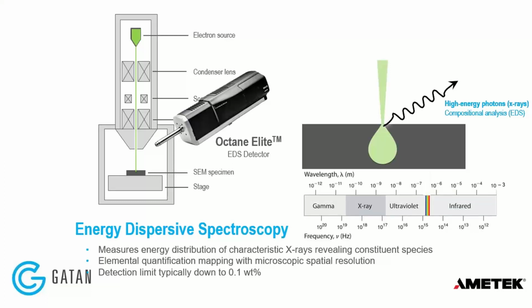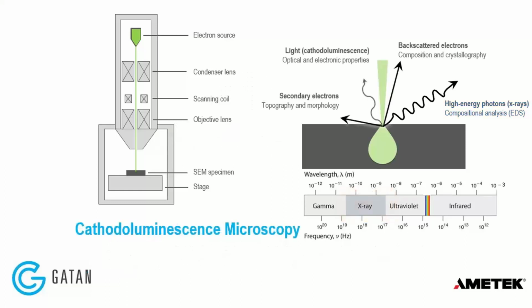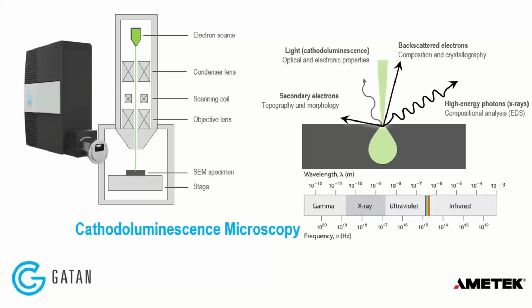All right, and here's an image of the electromagnetic spectrum, where for EDS we typically get something in the X-rays from 10^19 to 10^17 hertz frequency. So looking back at the many processes that are stimulated in the specimen when struck by an electron beam, the other that we're going to investigate today is cathodoluminescence, which is just light that's emitted from the specimen.